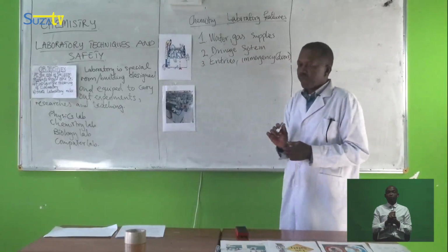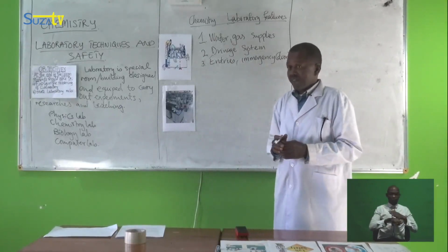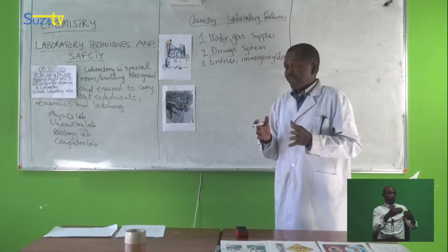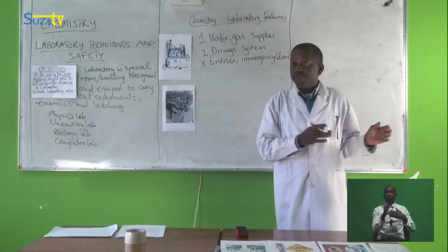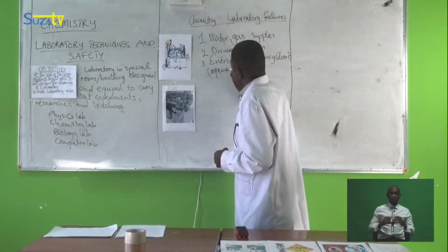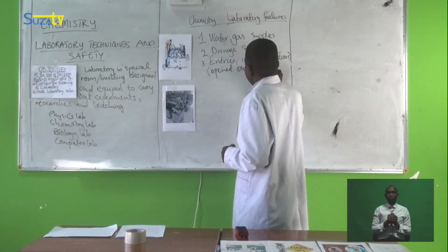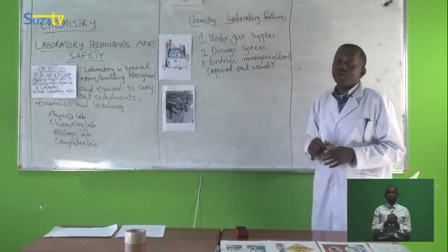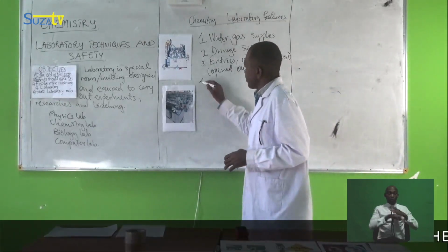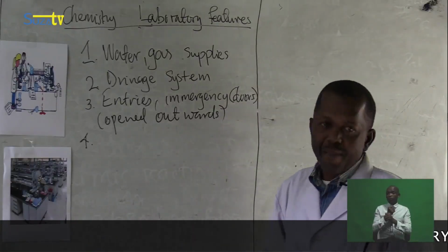That is a very important issue. In case of an accident, it becomes easy for anyone inside the laboratory to escape. Also, a laboratory should have safety equipment.